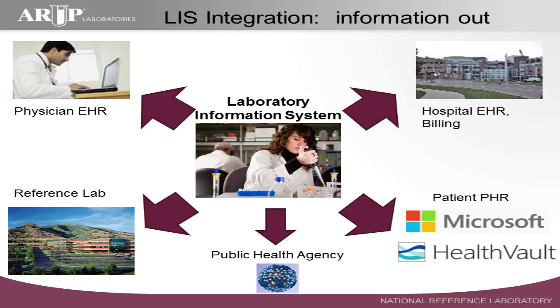Well, it obviously goes to the hospital electronic medical record or electronic health record, as the government likes to use the term EHR instead of EMR. That's a very common place. Now, some healthcare systems will have their lab system and their hospital EMR as part of one big system. Epic is a good example. Cerner is a good example. You may have a Cerner EMR called PowerChart, which actually was installed here at the hospital. And the lab may be using Cerner's lab system. So it's all part of one big database.